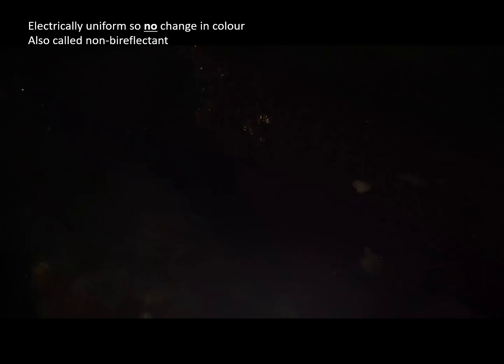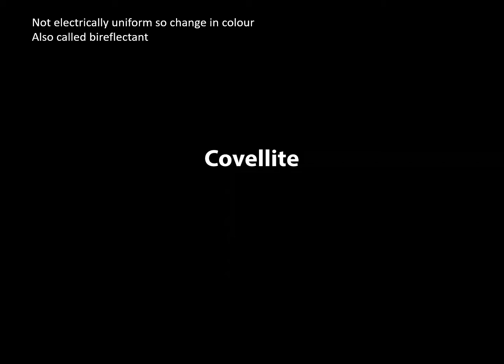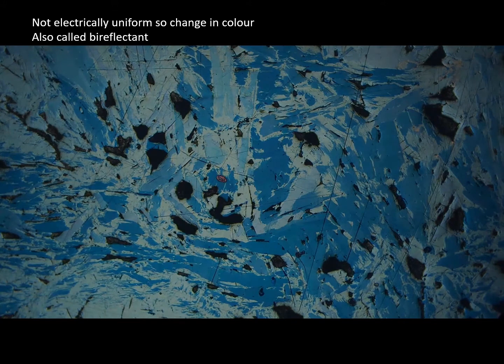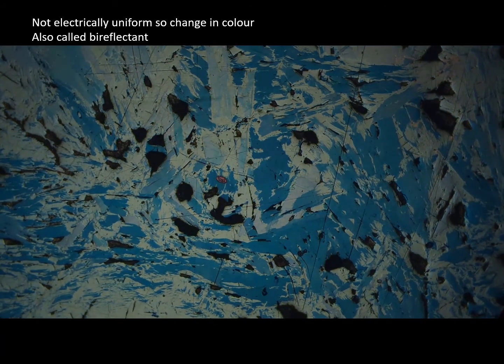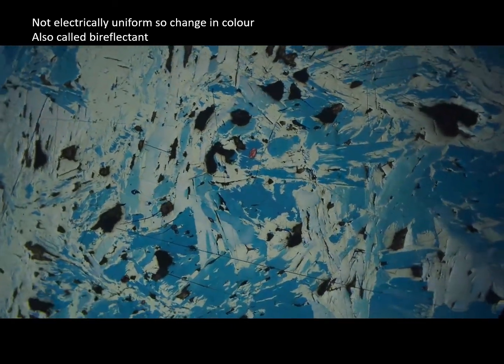All right, now we're going to move on to look at covellite. Covellite was our example where we can see a number of different colors, from this bright blue here to these lighter blues here. And as we rotate the stage, let's just follow this. You can see this is going from light blue to dark blue.